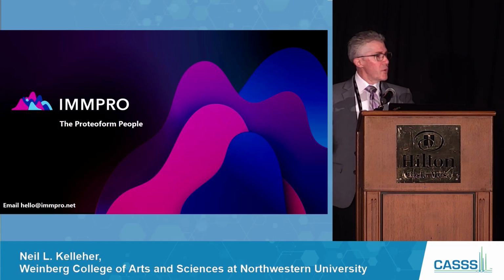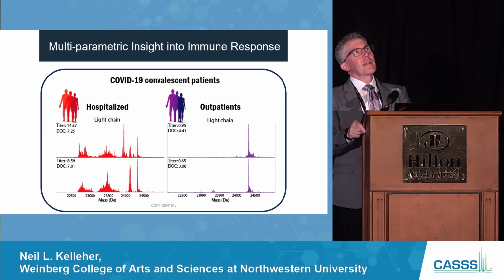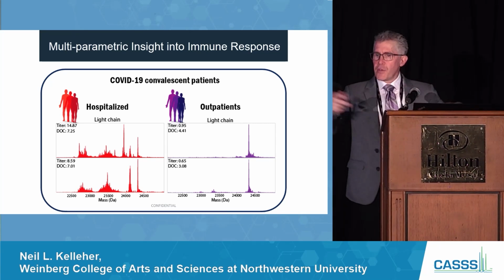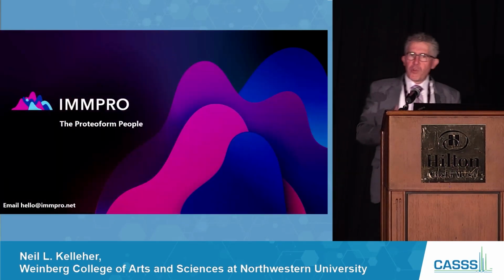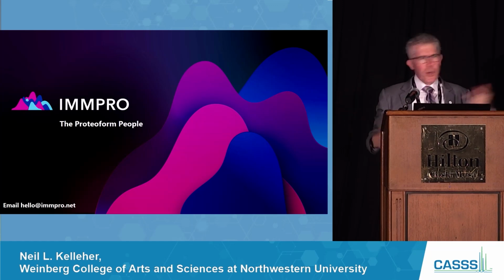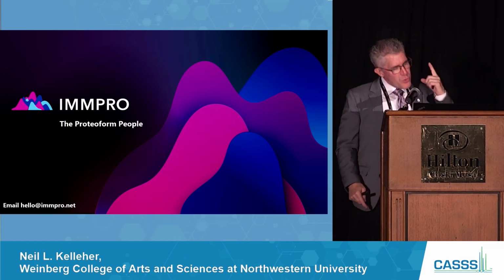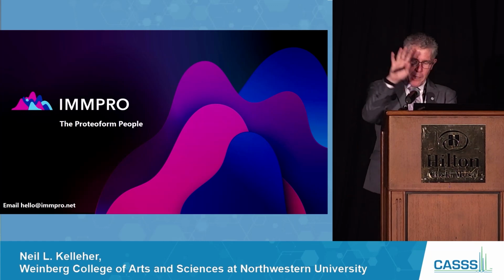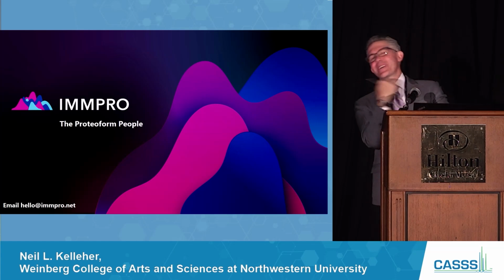But if you disagree with that, let's talk, because that is exactly the point where people all the time are just going to digest. You've got these labs that are incredible bottom-up organizations, and you just put it through the sawmill. Let's chop it up. When you do that, you have artifacts that are introduced, you have all sorts. Okay, I'll stop.